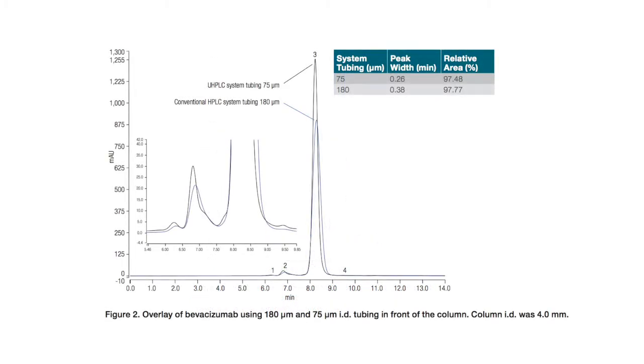However, the use of small 75 µm internal diameter transfer tubing and low sample volumes of 1 µL on a low dispersion UHPLC system eliminated peak dispersion, resulting in excellent chromatography. Furthermore, the effect of solvent addition in the mobile phase was evaluated and found not to improve peak shape, confirming the absence of secondary hydrophobic interactions with the MABPAC SEC-1 column.